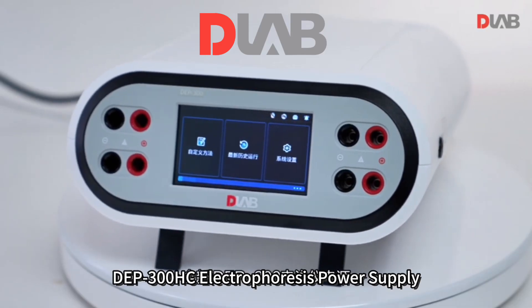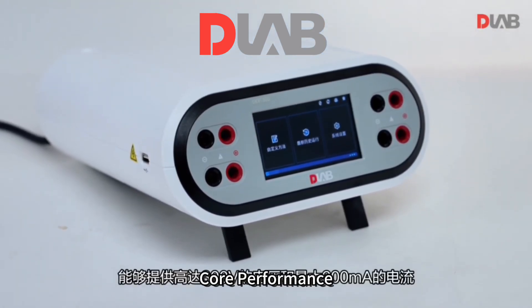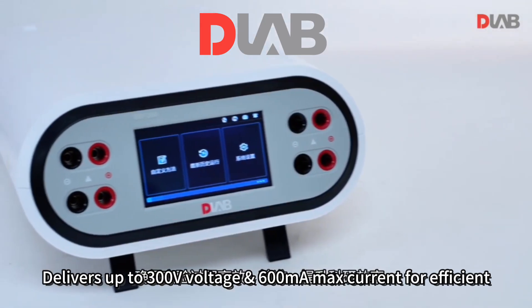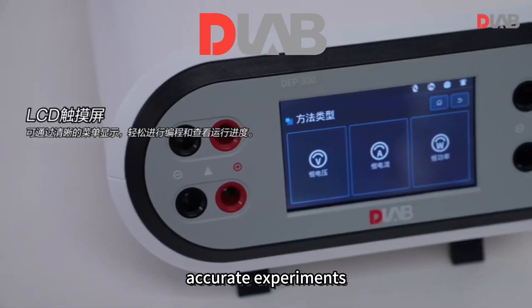DEP300HC ElectroForce power supply, brand new model. Core performance: high current design delivers up to 300 volts and 600 milliampere max current for efficient, accurate experiments.